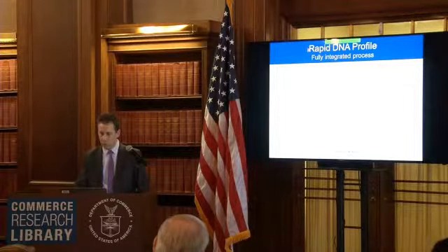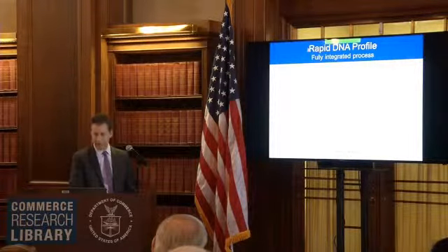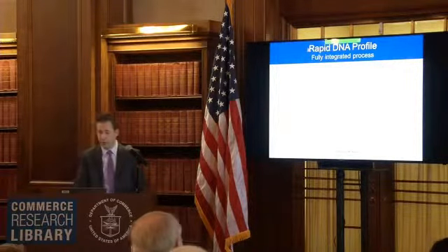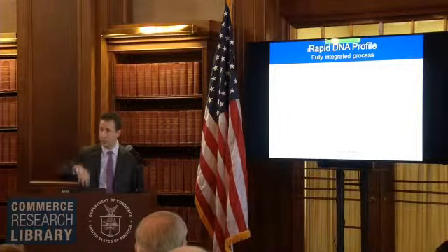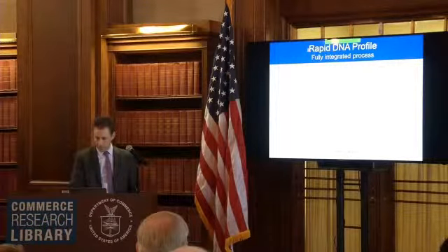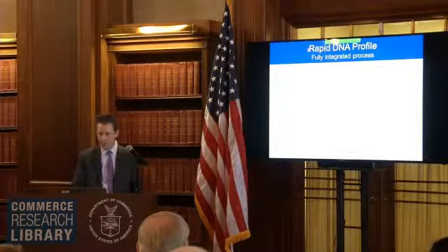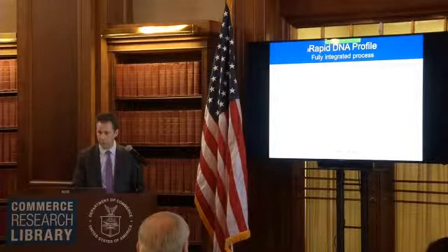We have two of these systems at NIST that are supported by the FBI and DHS. This is an example of a profile that was generated in less than 2 hours or so. Again, this is just putting a swab into a box and hitting go. There's no chemistry that the user has to carry out. So this is just the type of profile you get from an integrated instrument.